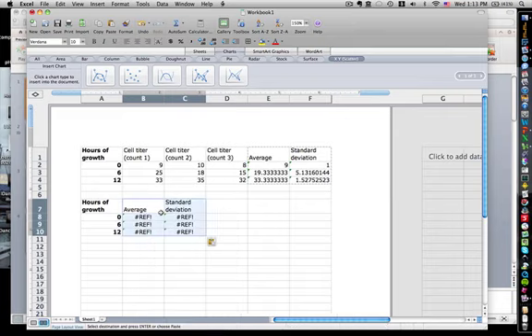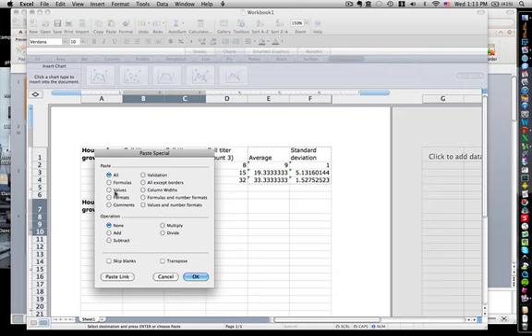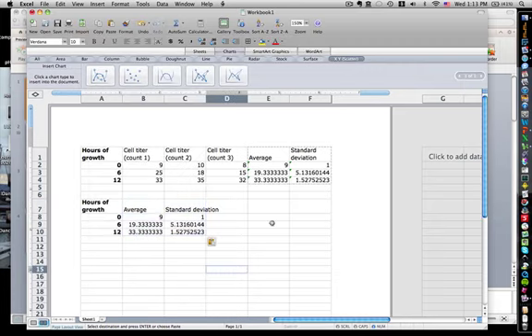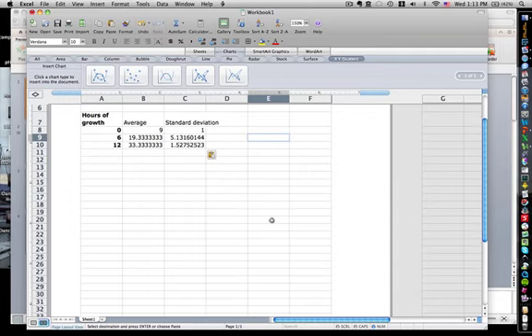Now, if you just click paste, Excel is going to give you an error. What you have to do instead is click Paste Special. Choose Values and click OK. Now you have everything in an organized format so the computer can easily generate a scatter plot.